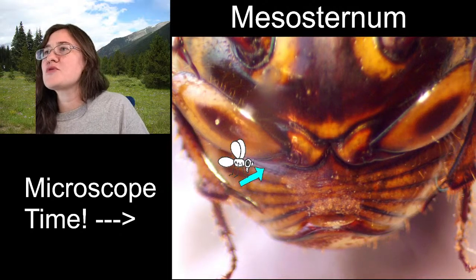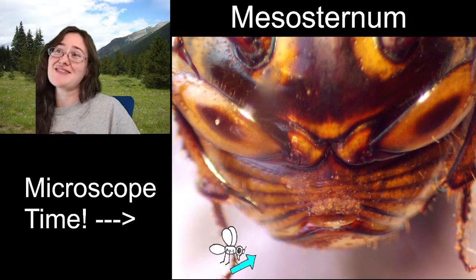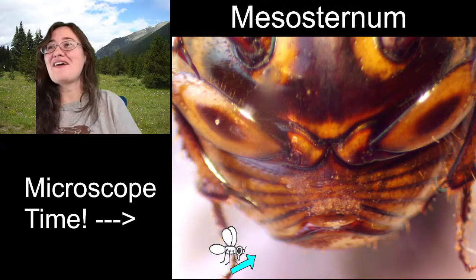I would call this one 1, 2, 3, 4, 5. I would say that this one has 6 abdominal segments. I'm right, it does look like a mantis head. How fun is that?